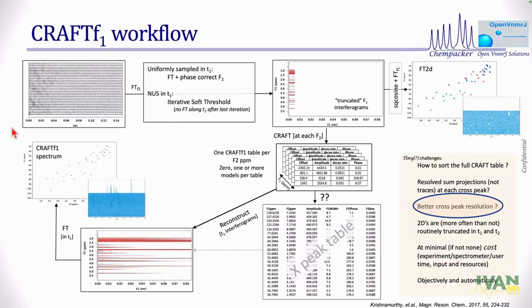Nothing was done other than just pass it through the table. And that is equivalent to a super linear prediction, except it's being linear predicted at a model level. At every model in this bunch of tables, I'm saying just linear predict. It's not linear prediction, it's just a mathematical operation of how many points you want to simulate, you want to calculate, and that's about it. It's not even a function. The function already exists in there. I'm not even fitting a coefficient.